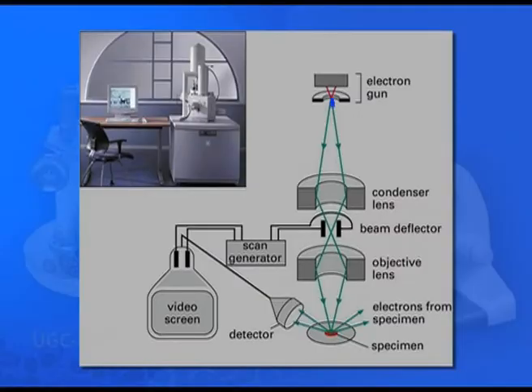Unlike transmission electron microscopy, scanning electron microscopy never captures the entire image of the specimen. Instead, it collects the electrons which are scattered by the sample. It produces images by probing the specimen with a focused electron beam that is scanned across a rectangular area of the specimen. When the beam interacts with the specimen, it loses energy by a variety of mechanisms. This lost energy is converted into alternative forms such as heat and emission of low energy secondary electrons.